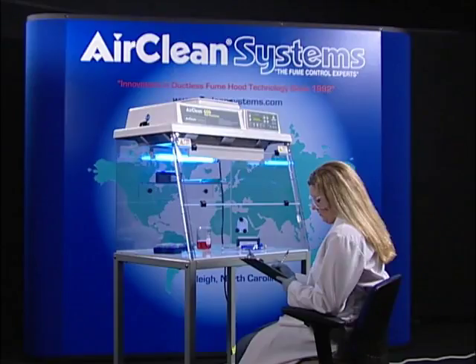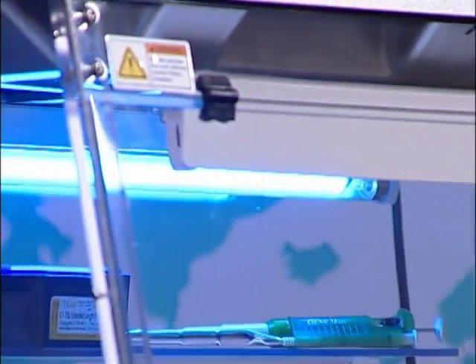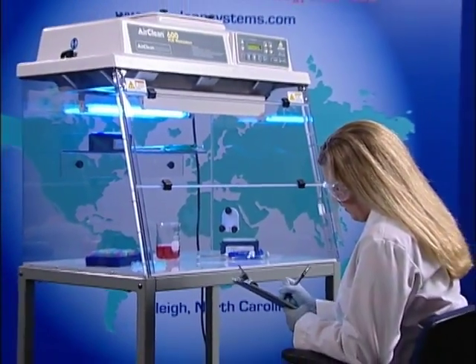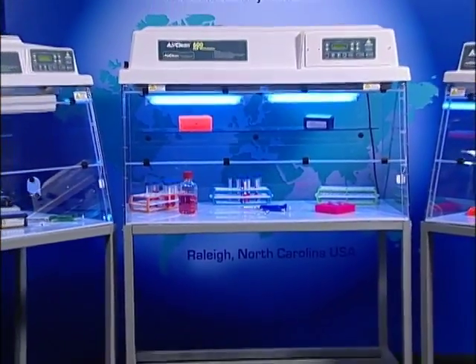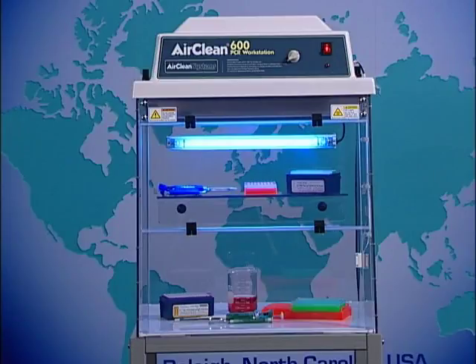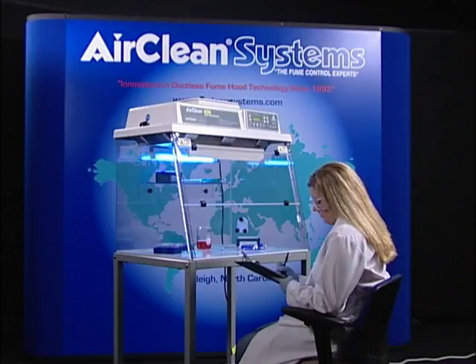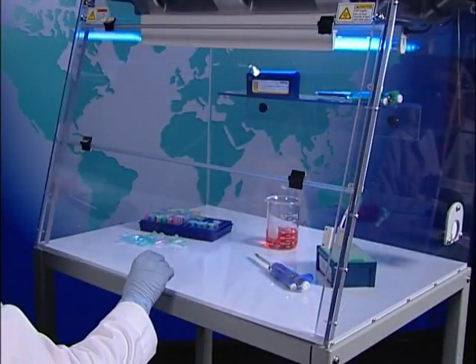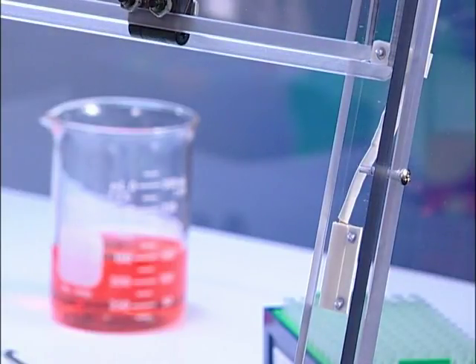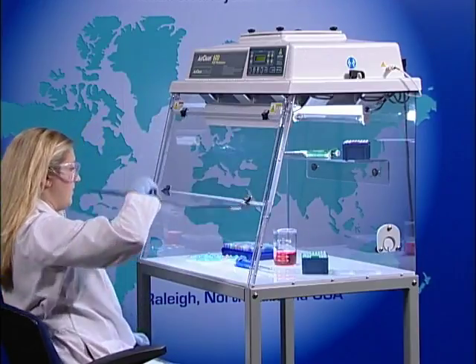AirClean Systems PCR workstations are designed and constructed with the application and operator in mind. The application requires the use of shortwave UV rays to sterilize the workspace between amplifications. Shortwave ultraviolet energy has been found harmful to humans at certain exposure levels. The workstations are constructed from polycarbonate that effectively reflects shortwave ultraviolet energy. The body is constructed in a single piece to eliminate potential gaps, which would allow harmful UV energy to escape into the operator's work area. AirClean Systems PCR workstations are manufactured to ensure the operator is never exposed to harmful UV energy.